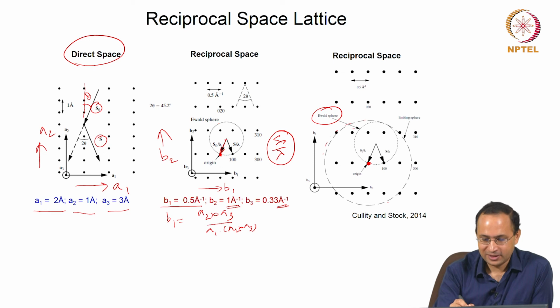Now, considering this as a center, you can draw this sphere that will cut, if there is a diffraction here for the 1 0 0 plane, it will cut, and this vector which you can find by joining this line. So, this one will be your diffracted beam, because this is again parallel to this, right.